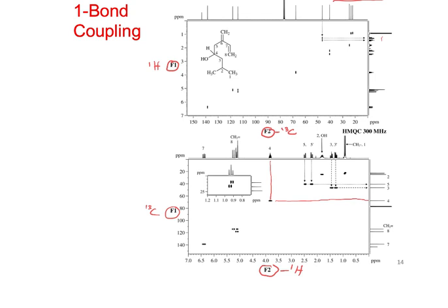Oh yeah, this was where we saw this one before. We talked about this already today. And notice in here, we see these two doublets are overlapping into that triplet, right? So here's one proton signal here, here's a proton signal on the other side, and they each go to a different carbon.